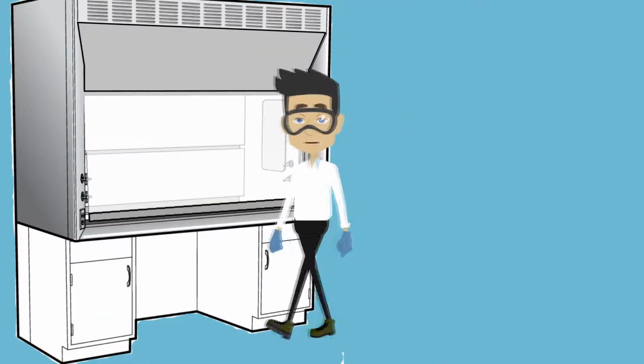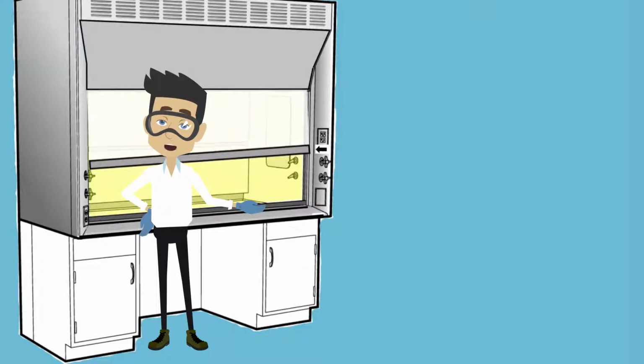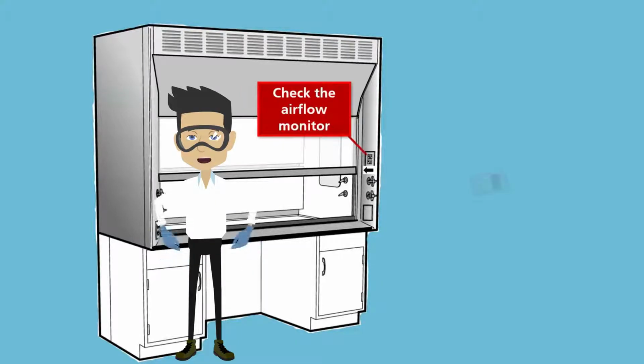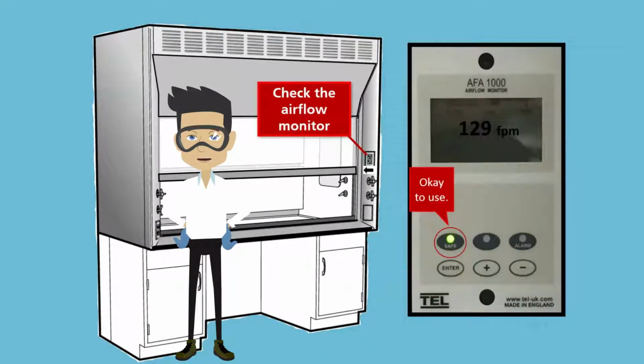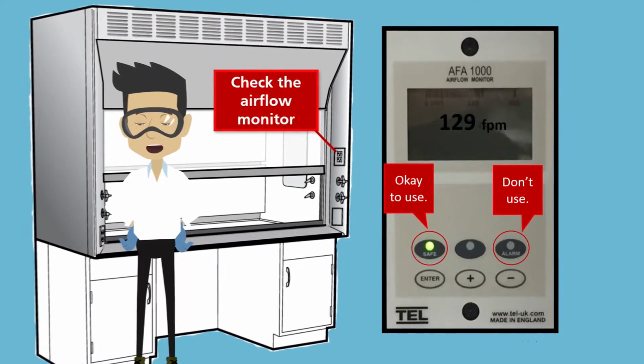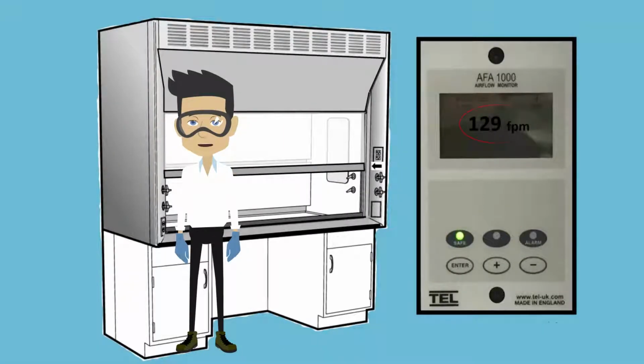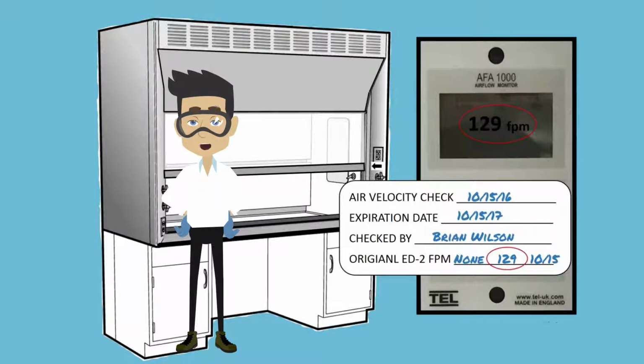After you check that the hood was certified in the past 12 months, turn it on, and raise the sash to the set point marked on the hood. Now, look at the airflow monitor to see if it is functioning properly. If either the visual or audio component appear to be in alarm mode, call the safety office for assistance. A fume hood alarm goes off for two main reasons: the sash is at an unsafe height or the airflow is too low to be able to effectively capture and eliminate contaminants. Check that the face velocity measurement on the airflow monitor is close to the face velocity on the sticker. It's okay if the monitor reading is plus or minus a few points.